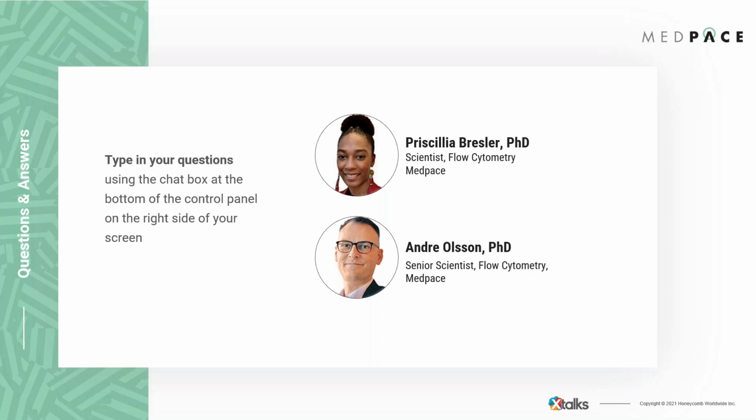Great. Thank you, Andre. Our next question is, in the case of an RO assay that uses a secondary antibody and an antibody with a different fluorochrome against a different epitope on the same receptor, how do you relate MFI to number of receptors for the different fluorochromes?